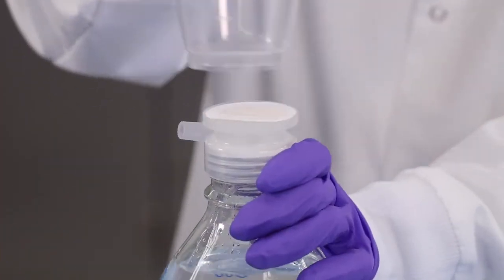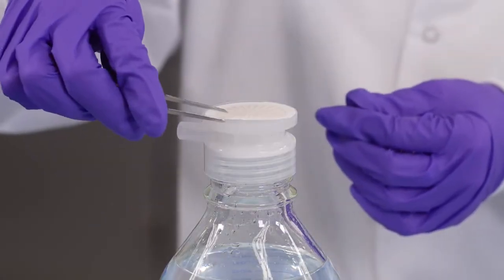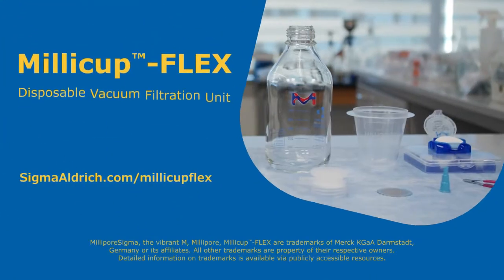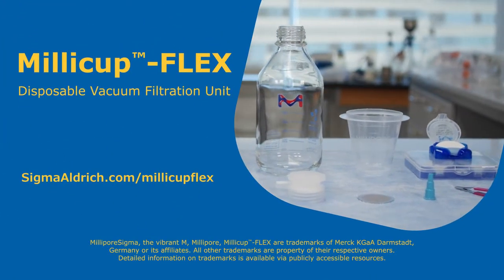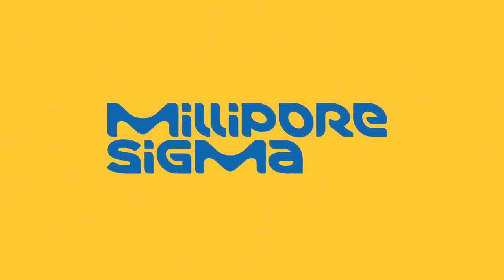The Millicup Flex is manufactured out of fully recyclable components. It can also be washed and reused as desired.